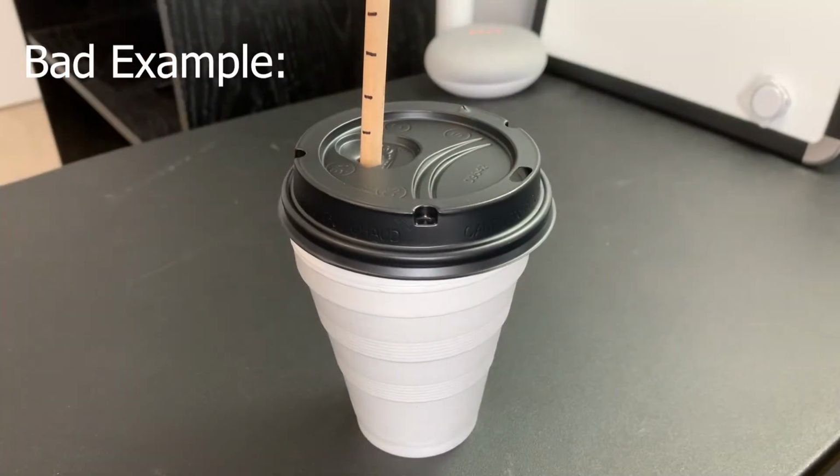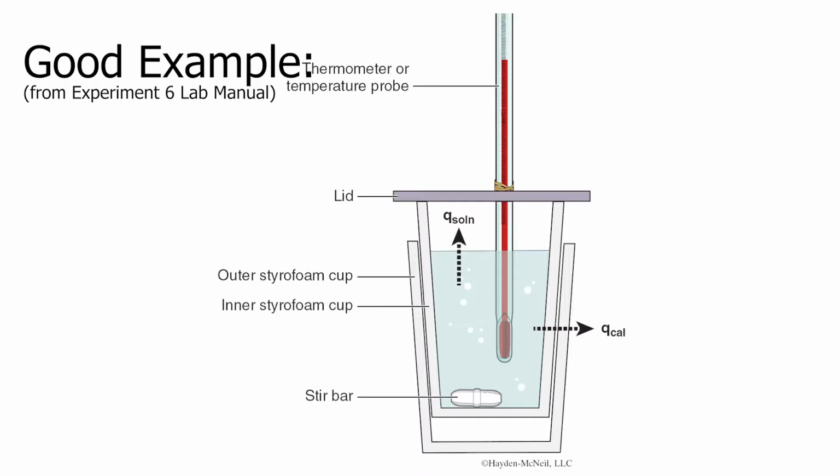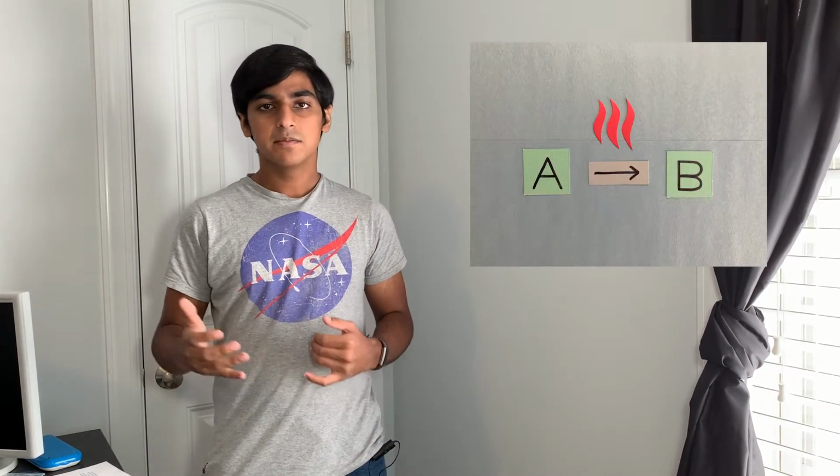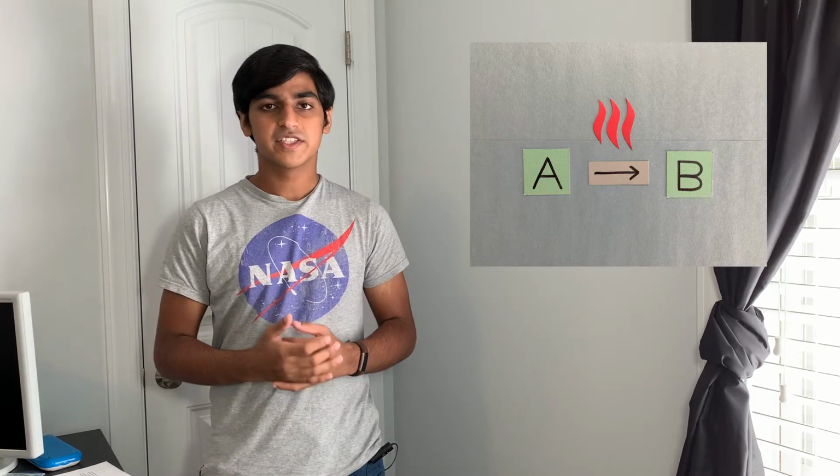In the case of experiments 2 and 6 of this lab, this device will measure the heat transferred from two substances reacting in a water solution. For these experiments, the water is the surroundings, while the substances which are reacting are the system. There are lots of different uses for calorimetry and a calorimeter. This includes measuring the amount of heat transferred between substances of different temperatures, or identifying a metal using its specific heat, or in the case of our experiments 2 and 6, measuring the amount of heat produced or absorbed by an endothermic or exothermic reaction.